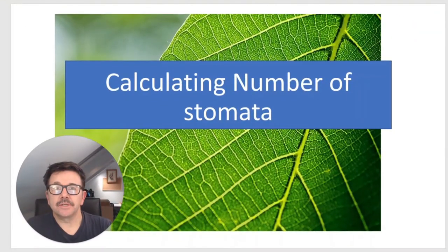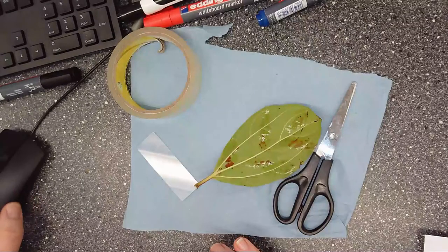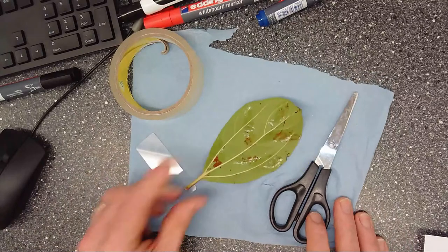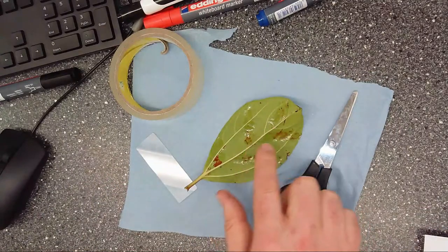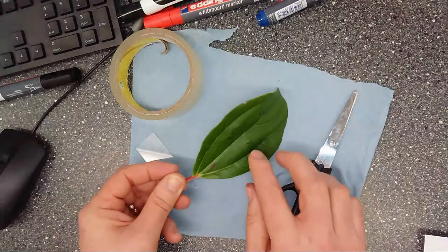So the first thing I'm going to show you is how to do a stomata print and how to use a light microscope to look at the stomata on the underside of a leaf. Right, okay, so what we're going to do is look at stomata on a leaf.